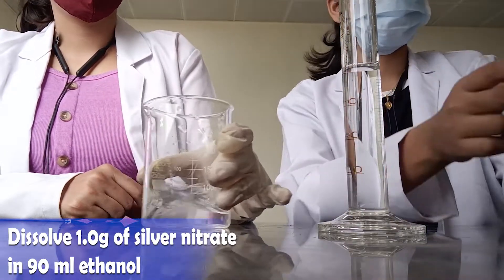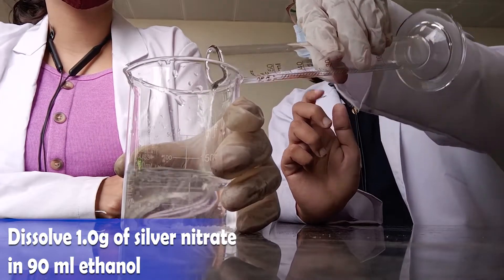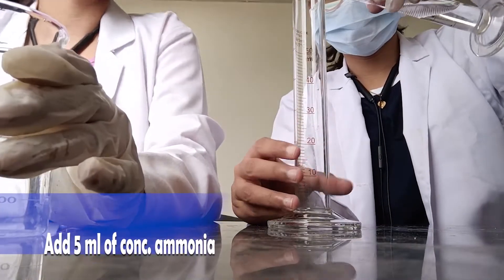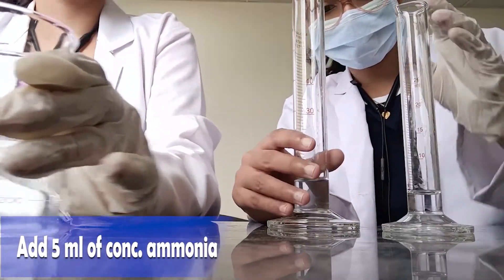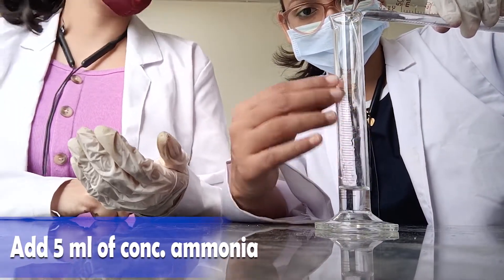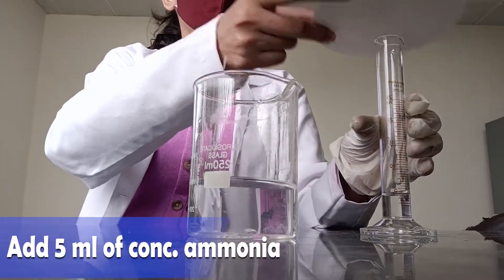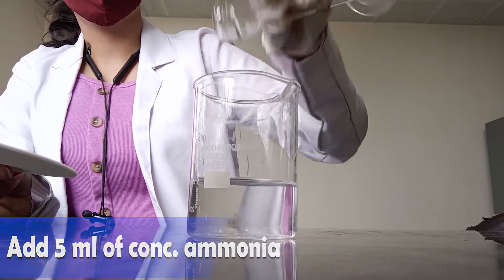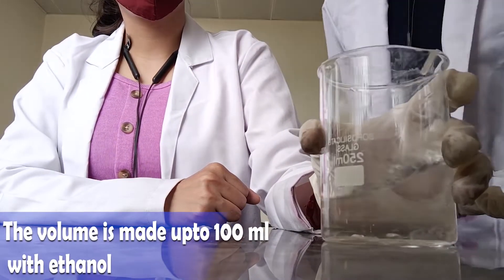Dissolve it properly. Now add 5 ml of concentrated ammonia solution in it. Measure 5 ml in the measuring cylinder and add it slowly.